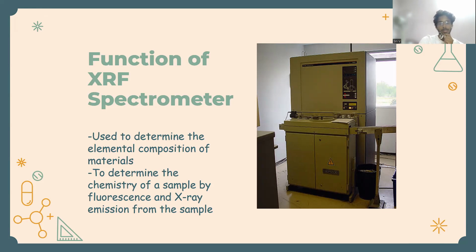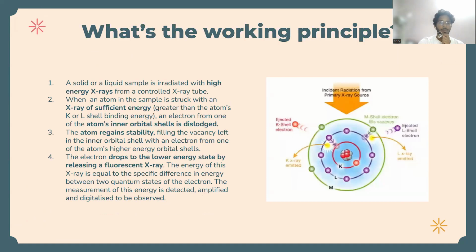Each of the elements present in a sample produces a set of characteristic fluorescent X-rays, a fingerprint that is unique for that specific element, which is why XRF spectrometry is an excellent technology for qualitative and quantitative analysis of material composition.